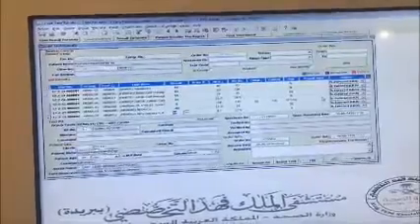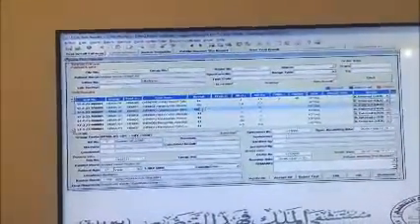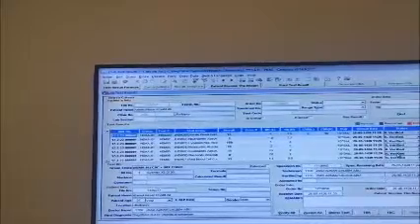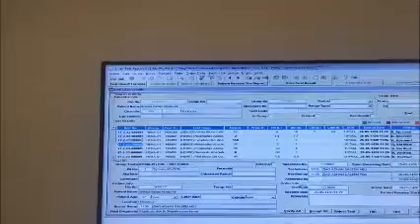It's just random data I inserted. You can change this to 150, for example. This one 2, for example. Any data. After that, you need to save it and do verify all. The system will verify all these lab results, and accept all.